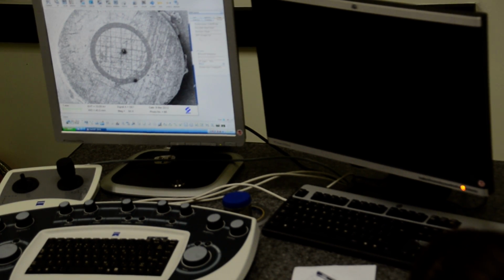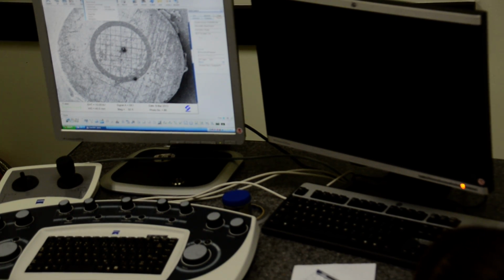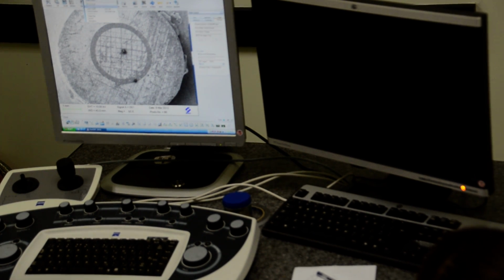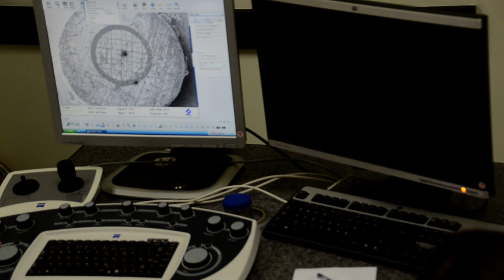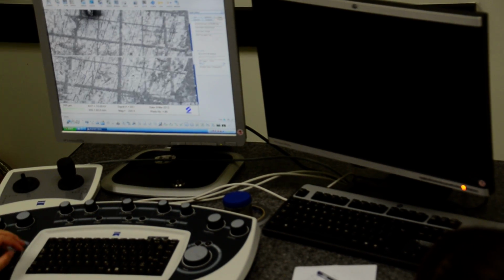Just now is the stage verification. Well, since we are in the stage verification, then I will talk more about all the functions over here under this first stage. Let's just get one sample.